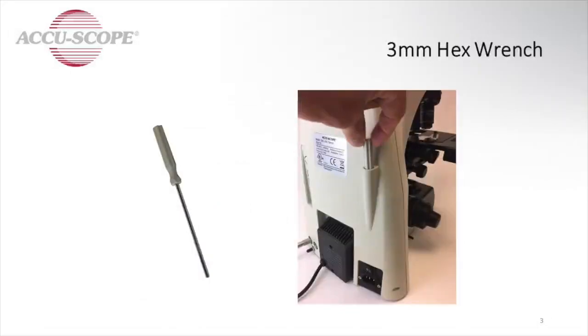Your microscope comes with a 3mm hex wrench, and you will use this several times during installation. For convenience, it's stored in the wrench holder on the back of the microscope frame.